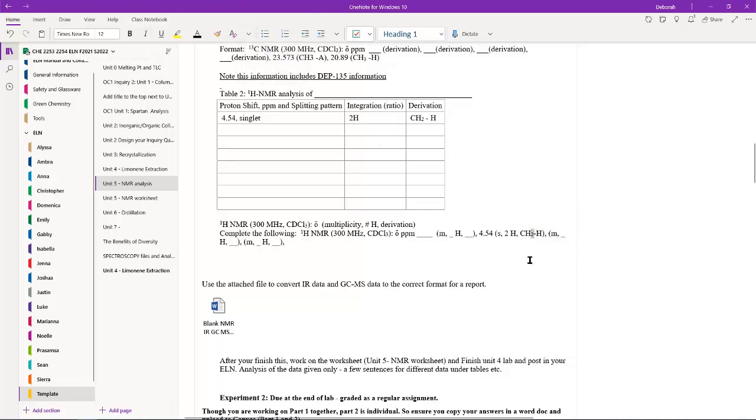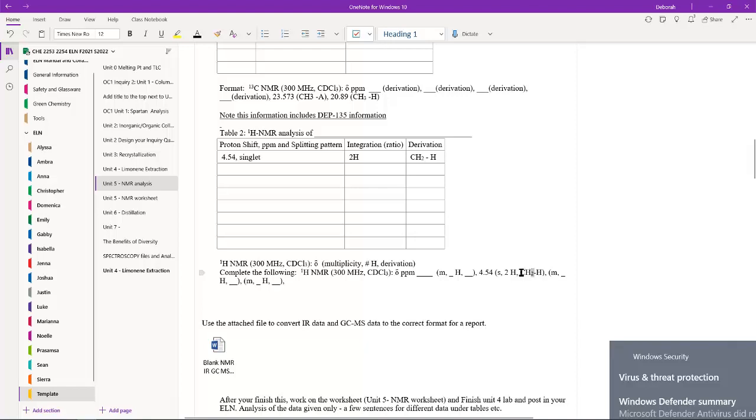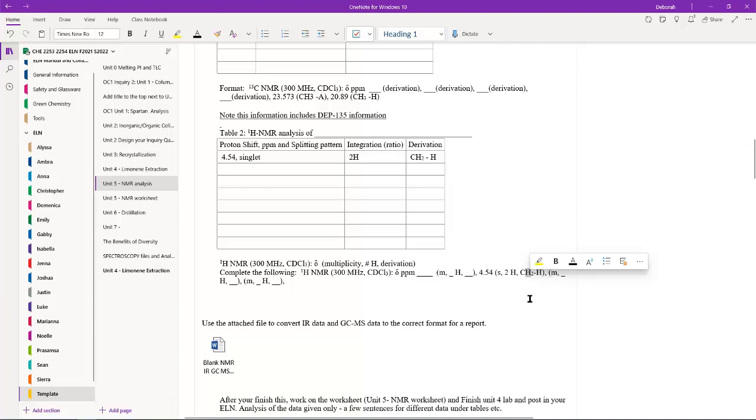Now, if you don't have a structure with letters matched to it given, those letters don't mean anything. So for a lab report, I would always draw your structure and label it like I have here. In a publication, you would have to do something like the CH2 and then show that this is attached to a double bond of some sort. You would underline that hydrogen so that people know that's what you're talking about. Let me give you an example. Instead of saying that the derivation is H, this could have been a CH2. I put an underline here, and then maybe I have something that represents this on the double bond to a carbon, something of that nature. That's how papers usually do this.